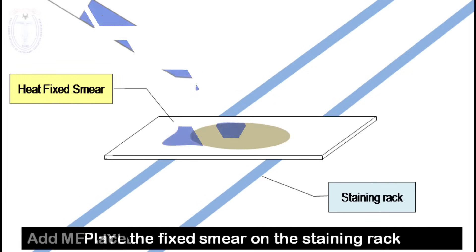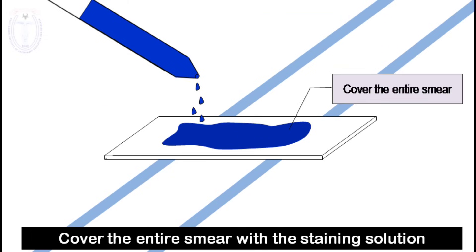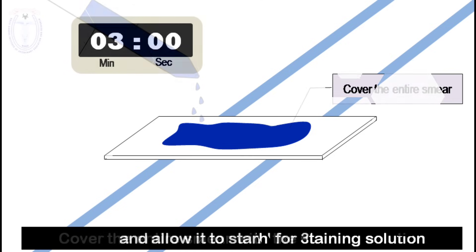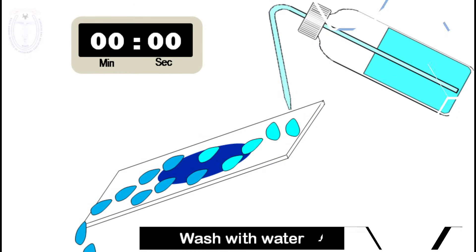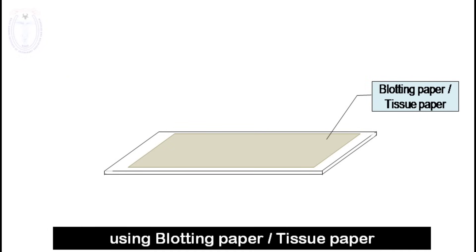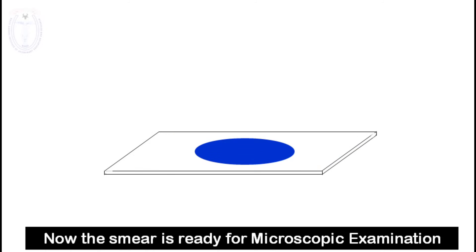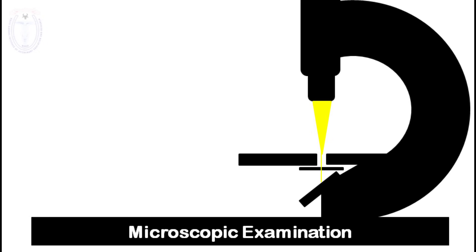Add methylene blue staining solution over the smear, covering the entire smear with the staining solution, and allow it to stand for three to four minutes. After three to four minutes, wash it with distilled water. After washing, blot dry the smear with blotting paper or tissue paper. Now the smear is ready for microscopic examination.